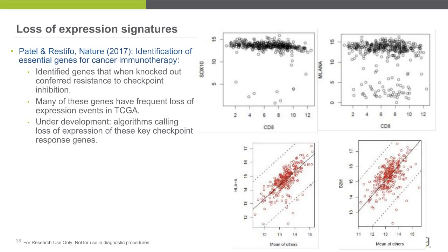So looking at the bottom right plot, there are many samples that have middle-of-the-road B2M. Take this sample, for example. It's got pretty average levels of B2M, but conditional on the rest of its antigen presentation machinery, that's really low. This is on the log 2 scale, so that's about 8-fold downregulated from where we would expect it to be, as is this sample.